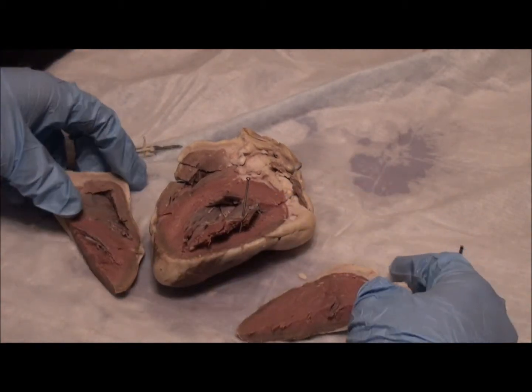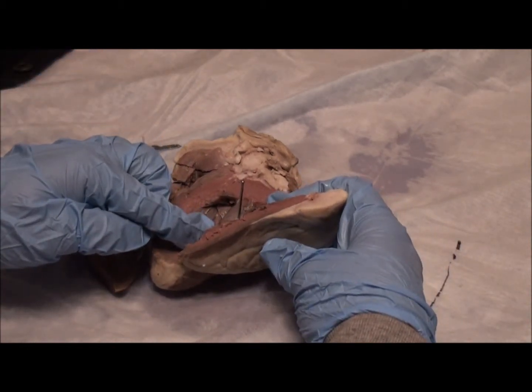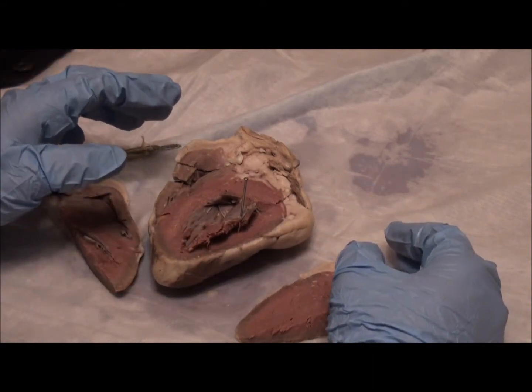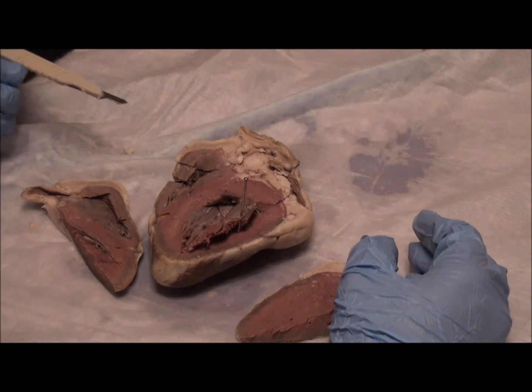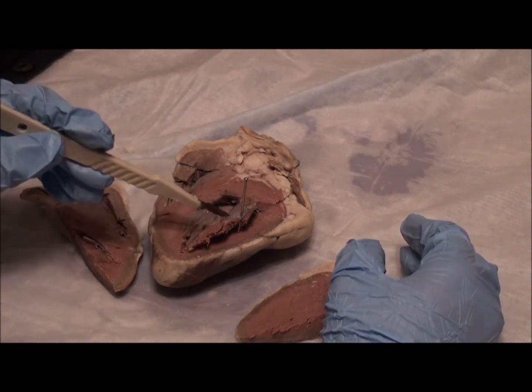Why is the myocardium of the left ventricle three times thicker than the right? The left ventricle pumps more blood to the body, and the right ventricle just pumps the blood to the lungs. So the thickness of the muscle is because of the more blood it's pumping. Point out the trabeculae carneae on the inner surface of the ventricles.